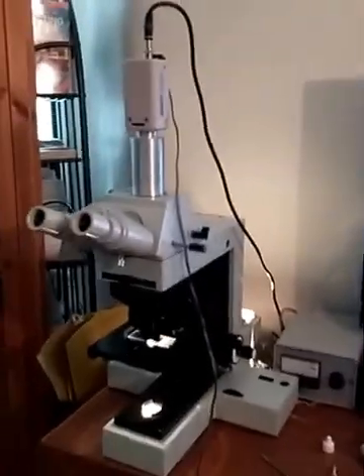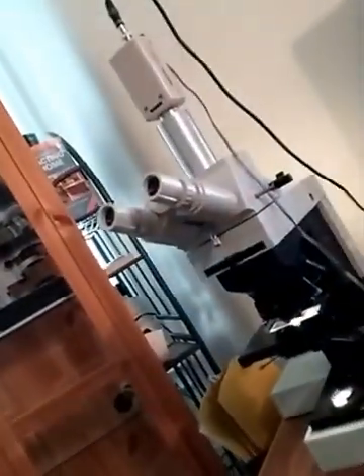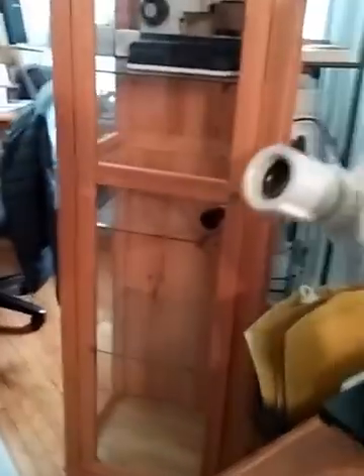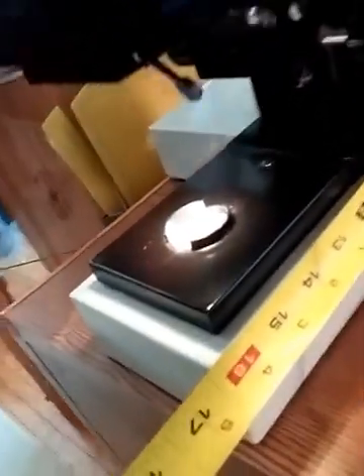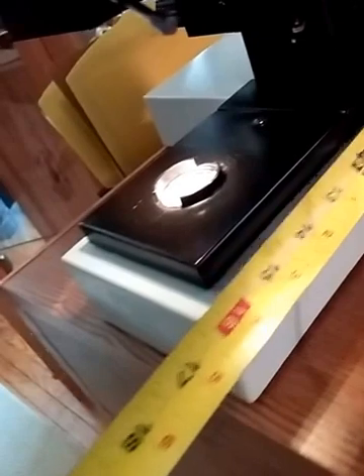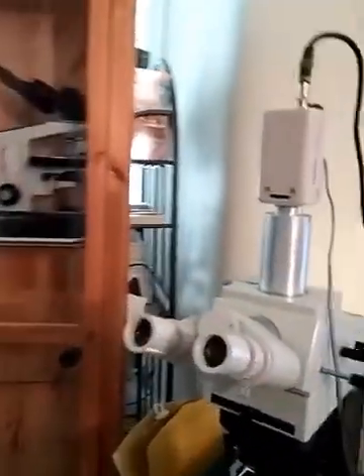I wanted to show you dimensions, just to give you an idea of what this thing is size-wise. From front to back we have — 16 inches. And then to the top of the base you're 15 inches. And then 26 inches to the top of the video camera.